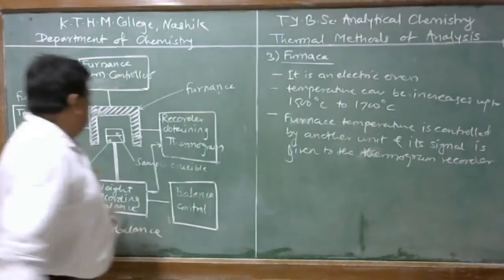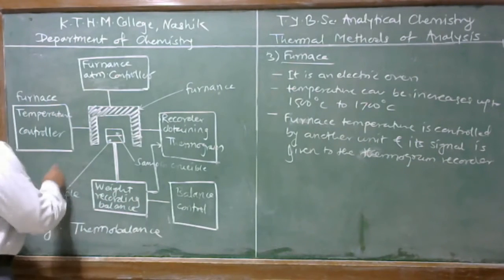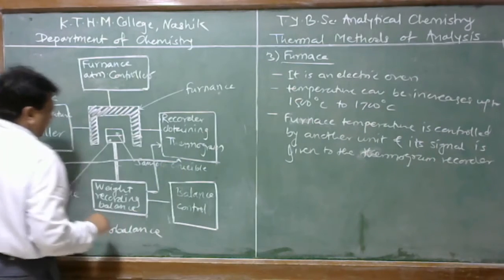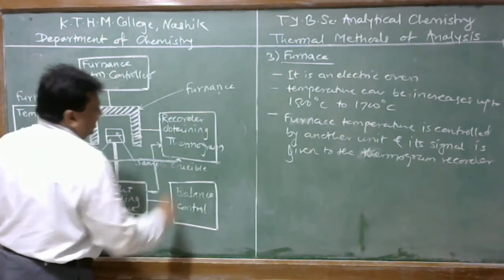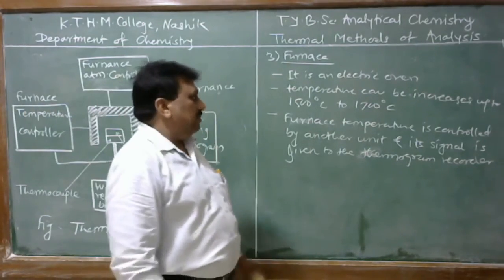Therefore, similar to this weighing balance, the temperature signal is also given on the thermogram recorder.